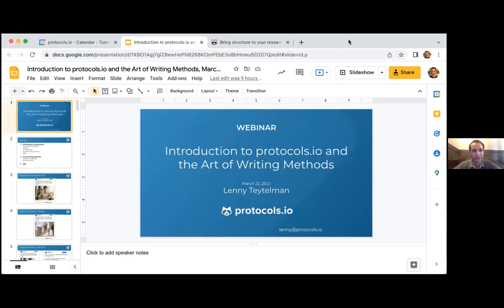I am a scientist by training, a geneticist, both in experimental and computational biology. And it is my postdoc experience and the struggle with optimizing and correcting a method, a microscopy method, that led me to this obsession with creating a central place to share method details.